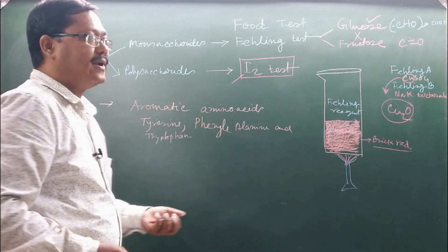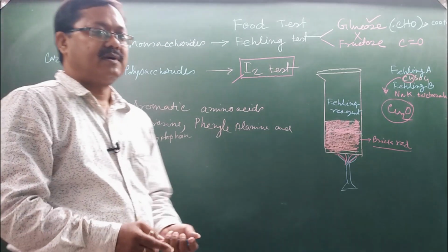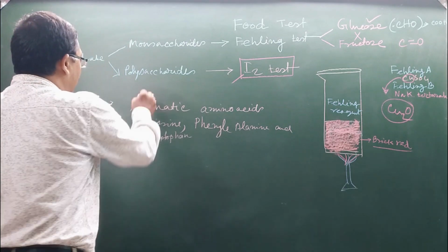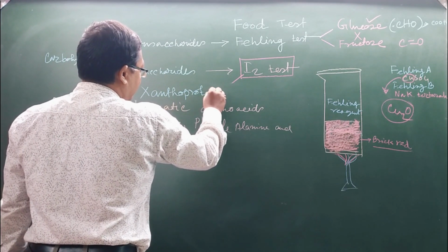These three aromatic compounds are easily identified by a reaction. This is called the Xanthoproteic reaction. The reaction is called the Xanthoproteic reaction.